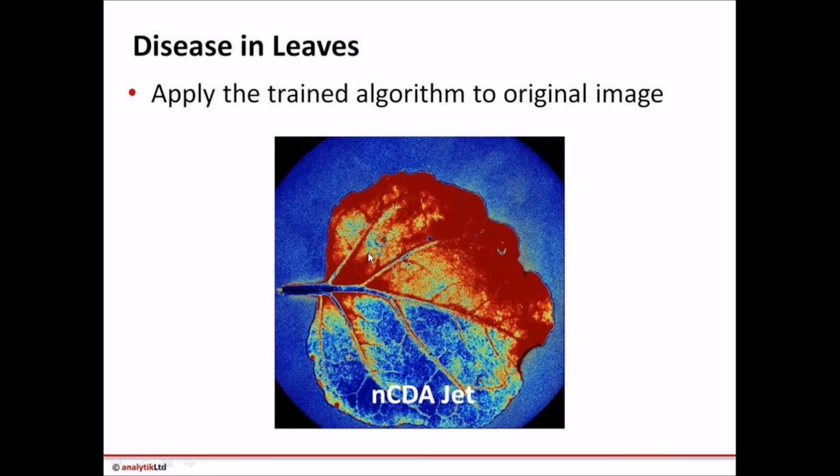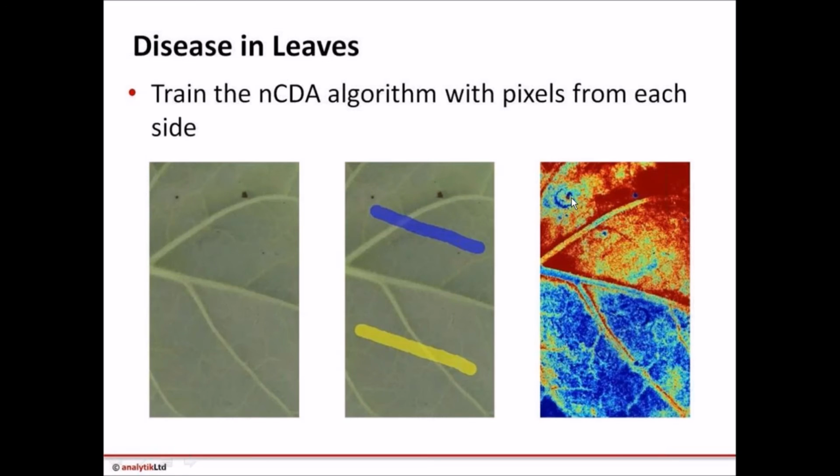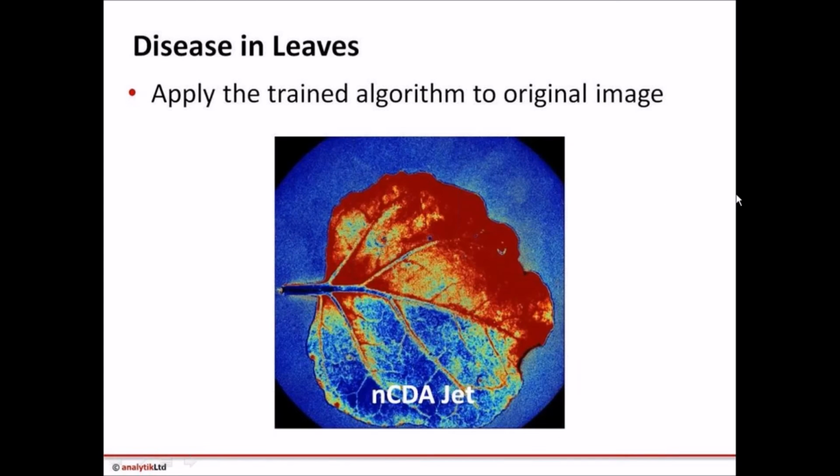So we can see that the infection is spread a lot over this top half. You can just about see a little damage of the inoculation. In fact, if I go back to here, you can see the points where it's been inoculated, highlighted. Very hard to see in an RGB image. Can't see it. But it's very obvious once you've done these models.